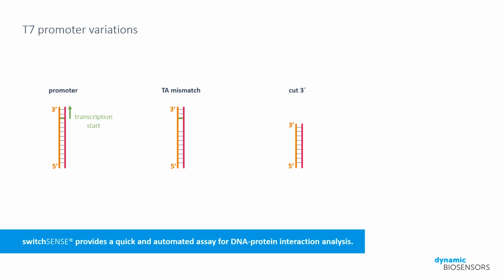Of course, with a sequence-specific DNA binder, you would like to ensure that in your chosen conditions there is no off-target binding taking place. Specificity can be crucial in medical applications such as CRISPR-Cas9 targeted gene therapy. The real-time control of non-specific binding to a scrambled DNA sequence will give us full control and maximum data from this quick experiment. This sounds like many measurements to you?